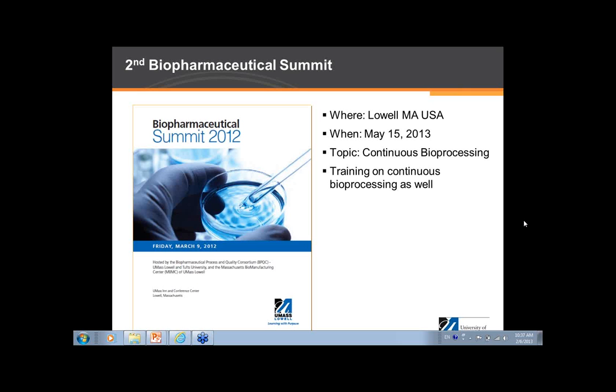Is that something that you agree with, Dr. Yoon? I think so. Just to add one more comment, at UMass Lowell in my research group, we are looking into metabolic flux balance analysis, and we're trying to match that metabolic flux balance in real time to the dielectric spectroscopy. By measuring the metabolic balance in the cell culture in the bioreactor, we can have a more direct indication of when apoptosis is coming out.